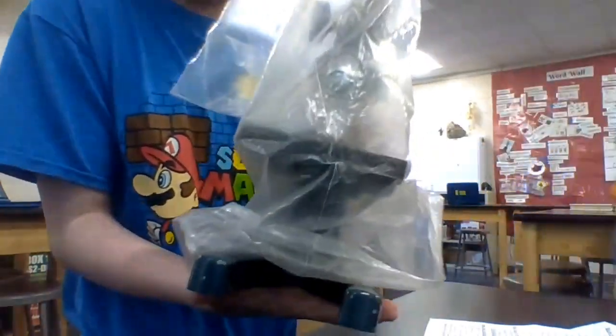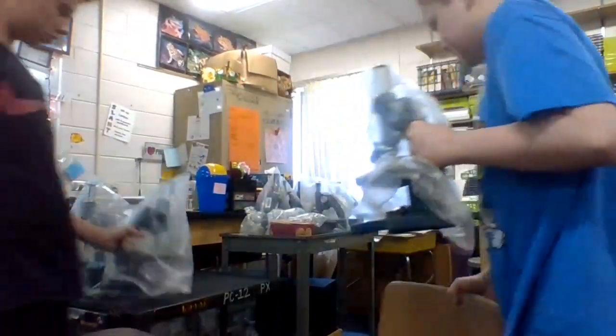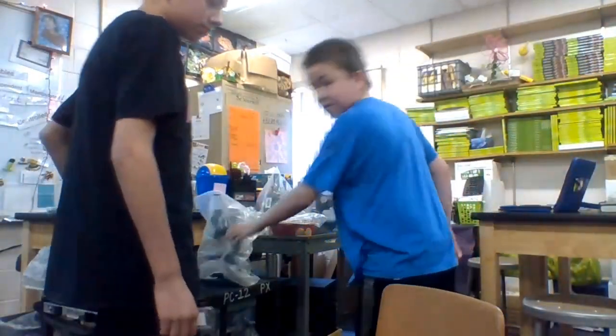And then you have to turn and carry it at the base and the handle like this. Make sure so the microscope won't fall off the edge. That's how to use a microscope.